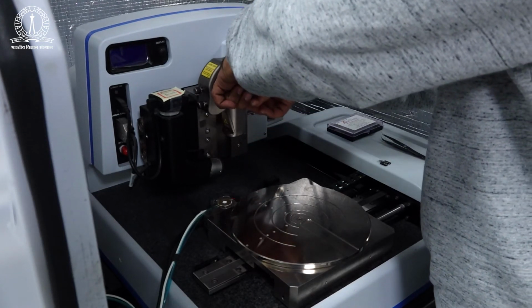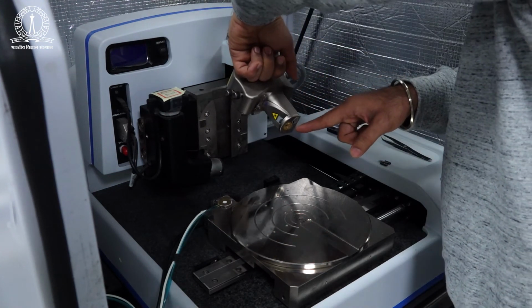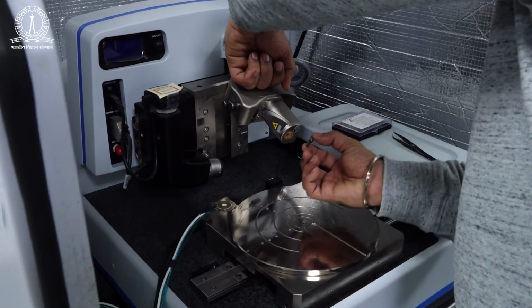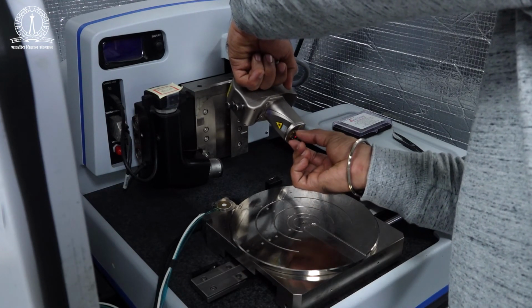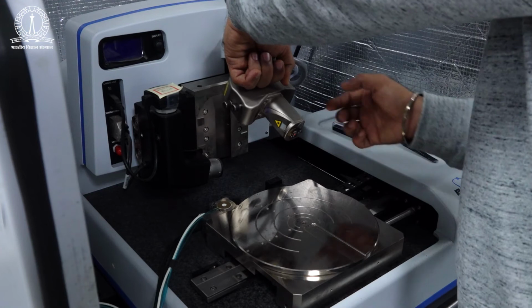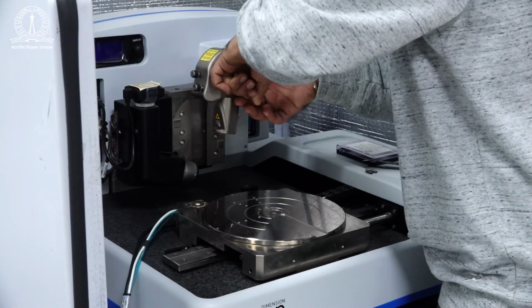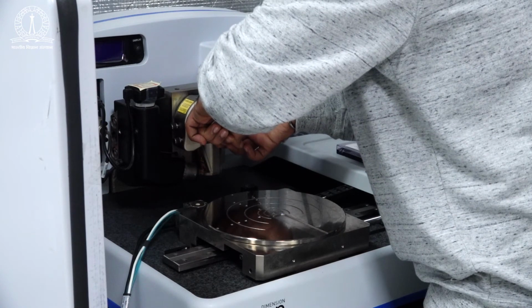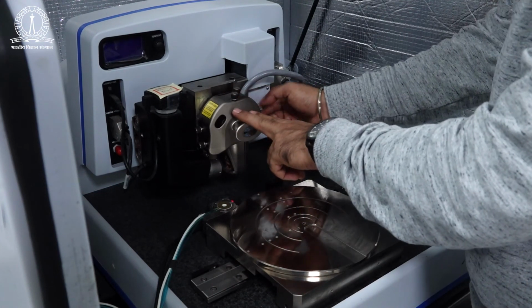It's taken out like this very carefully. It's called a dovetail fixture. Now, as you can see here, there are 4 pins. To these 4 pins, there is a correct alignment. We match this holder and press it. It's a press fixing fixture. Once that is done, you get a feel in your fingers that it is fixed. You put it back again very carefully. We cannot just drop it down. Once it has gone into its base position, we tighten this screw again.